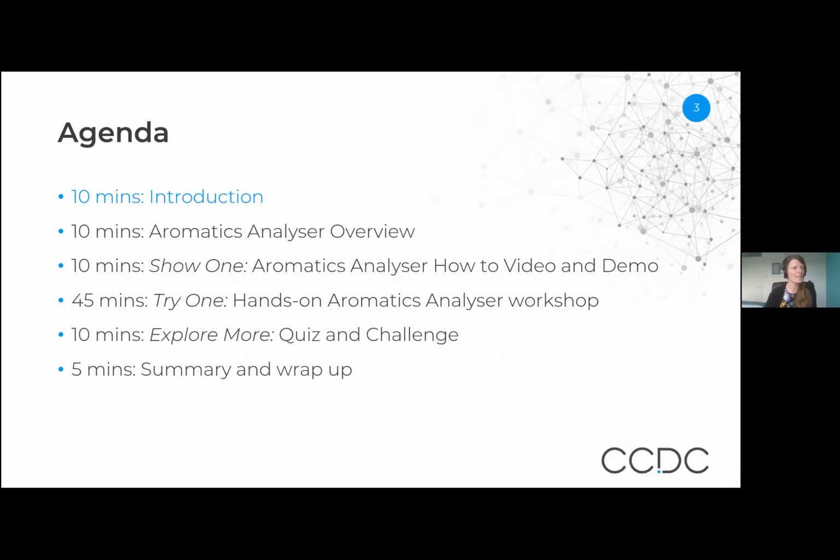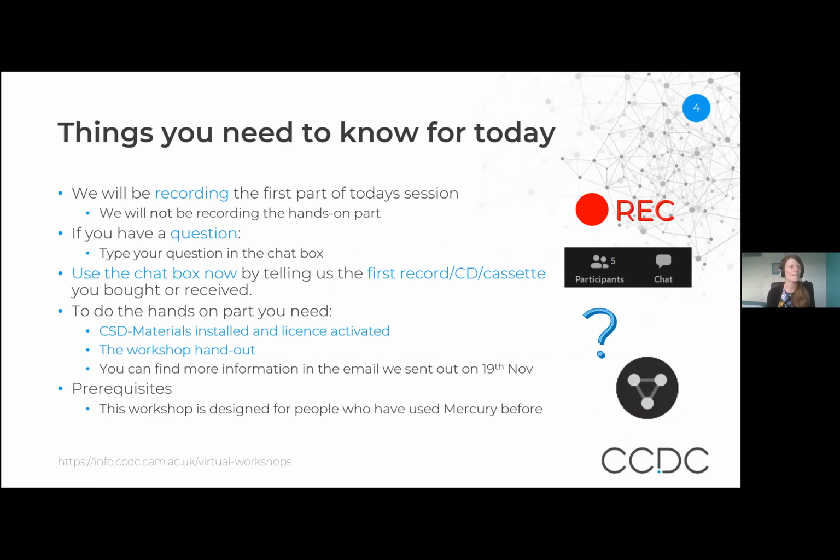In this session, we're going to cover a short introduction, and then Joanna is going to be giving us an overview of Aromatics Analyser before leading on to a video and a demo. It will then be your opportunity to try out the tool in our Try One section of the session, and then we'll be exploring more with a quiz and a challenge before we complete the session with a summary and wrap up. Just a reminder, we're going to be recording the first part of today's session. We won't record the hands-on part, and we'll let you know when we stop recording.